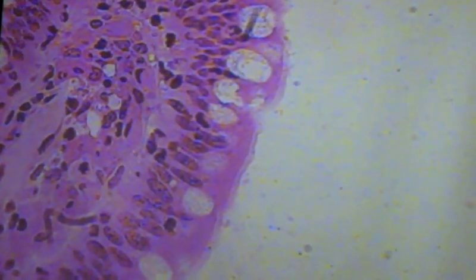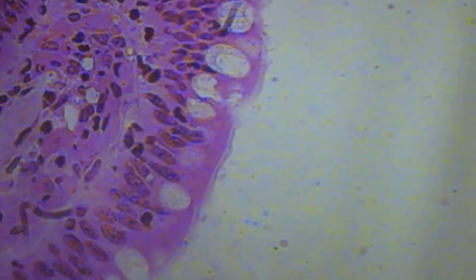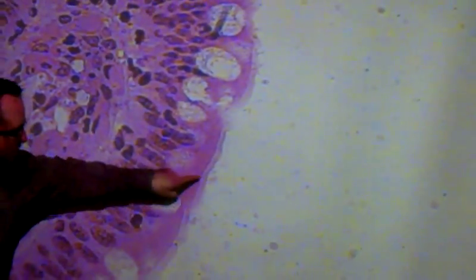Right here you can see that little line — that's called the brush border of the small intestine. Under an electron microscope, we can zoom in and see that it's actually a layer of little tiny hair-like projections called microvilli — minuscule individual projections that make up this brush border. So we have large structures that increase surface area like the plica circularis, medium-sized structures called villi, and then super small structures, microvilli, that make up the brush border — all there to increase surface area for absorption.